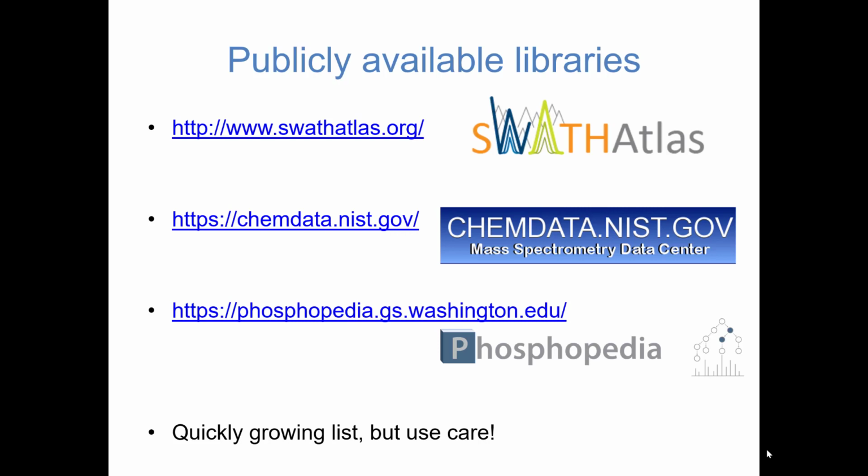It's not perfect, but it is pretty good. They don't, for example, have a mouse library, but they do have a tuberculosis library, because whoever wants to submit a library can do it. But it is all processed through a centralized pipeline, and it's pretty standardized. So I think it's a fairly safe library set to use.